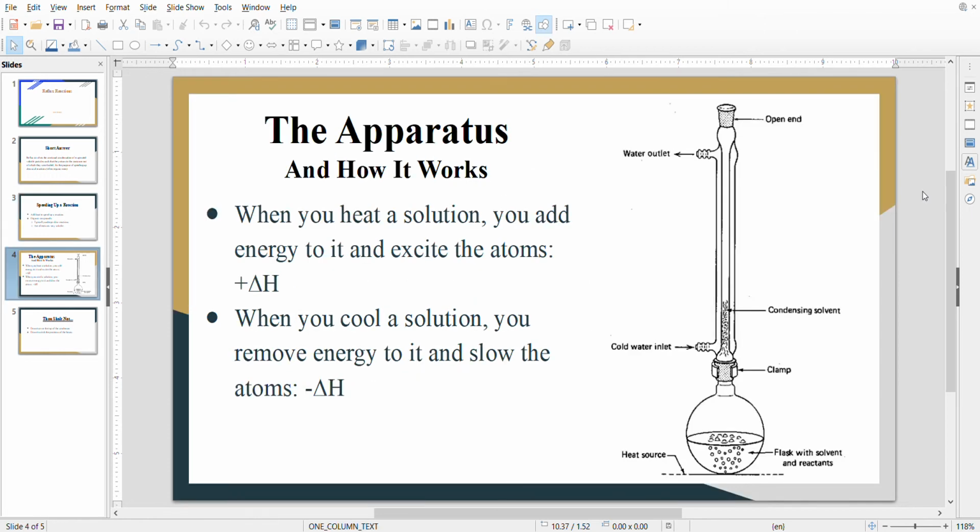Now I'll tell you how you would construct the mechanism for a reflux reaction. In the hood, you would place a round bottom flask filled with the solution into a sand bath or some other heating mechanism. And you could also put a stir bar into the flask as well to help with even heating, but don't start heating it just yet.